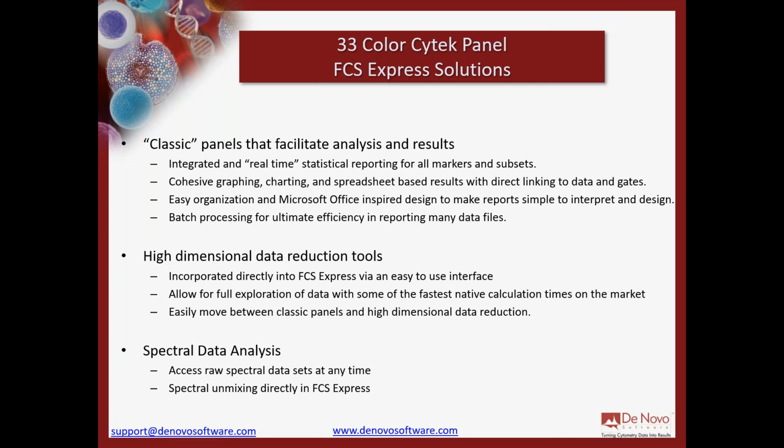We'll go into the high dimensional data analysis tools, which are incorporated directly into FCS Express, and a really easy to use interface. These allow for full exploration of the data with some of the fastest native calculation times on the market too. And the really cool thing about these in FCS Express, you can really easily move between classic panels and high dimensional tools to explore that data.